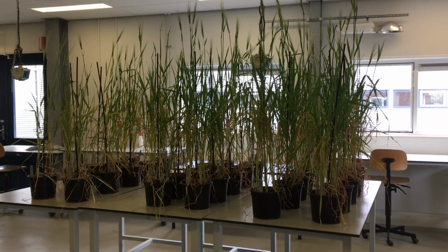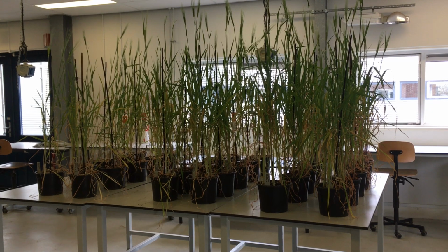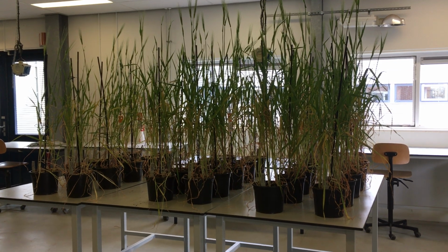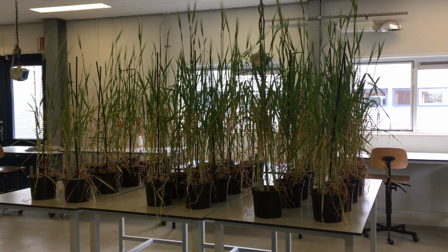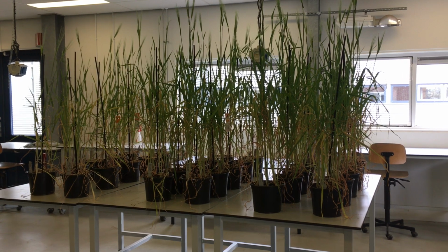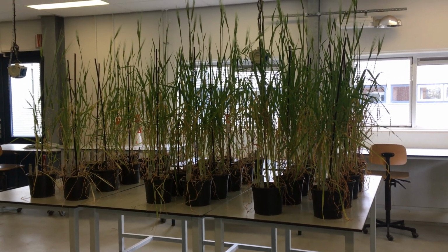Hello everybody, this is our practicum for barley and leaf rust. I will introduce you to Pauline. She helped us with this infection, and today we will demonstrate how we should score the plant. Collect the data, then you will use the data for data analysis in the computer room. Pauline, could you come into the picture?